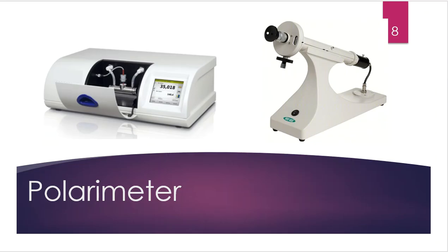So here are two pictures of different types of instruments for a polarimeter or optical rotation. You're going to have one or the other. This is not something that we can do in the wet lab. We need at least a piece of equipment in order for this to work for us. So I'm going to see them in probably one of two forms, something that looks like the one here on the left and something that looks like the one on the right-hand side.